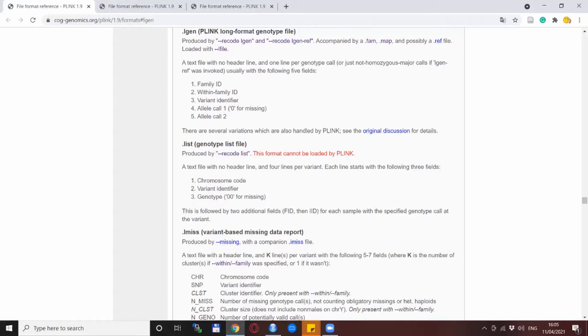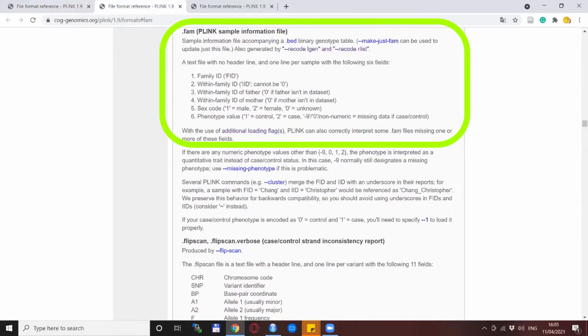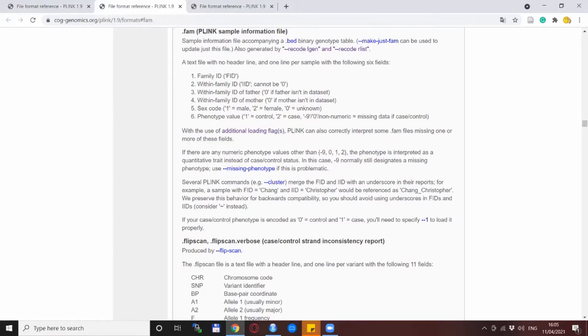Because columns two to five are already present in the final report it is very easy to create this file. And if you want to load the LGEN files with PLINK then you also need a FAM file. This is a file where we have each line for one individual. First column is family ID, individual ID, father, mother, sex code, and a phenotype.